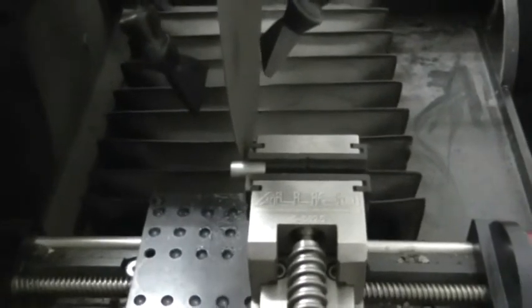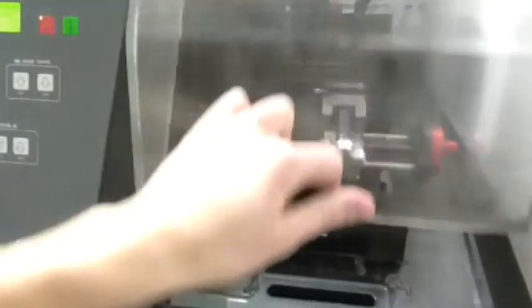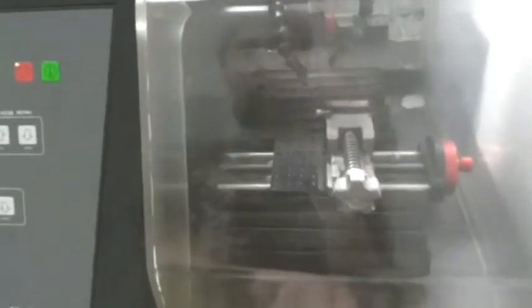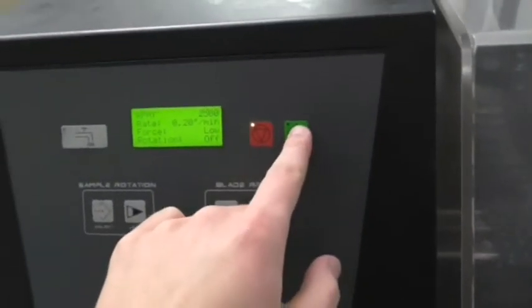What we are going to do now is close this shield, otherwise the machine won't start. And what we're going to do is press the start button.